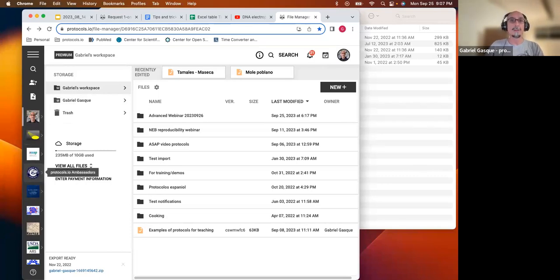Some of these workspaces were created by me, so I am the administrator, and some were created by somebody else, and I'm just a member. Some of the workspaces are public, some are private. We are going to be working on my private workspace, of which I am the administrator.